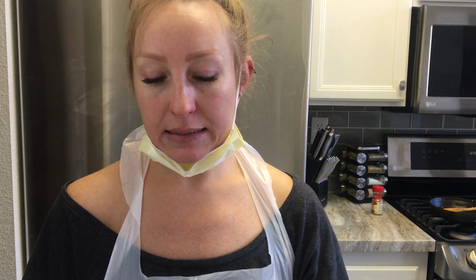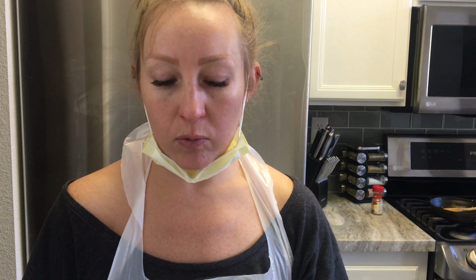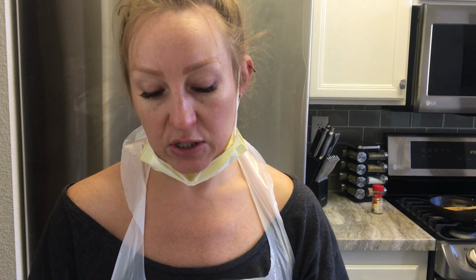First we use S. epidermidis, a staphylococcus, which we also did a short quiz on that I typed up today, and which lives on our skin. What this Kirby Bauer diffusion test does is test the resistance of S. epidermidis to 3 antibiotics. The first antibiotic was penicillin, which is something we've heard of for years and years.